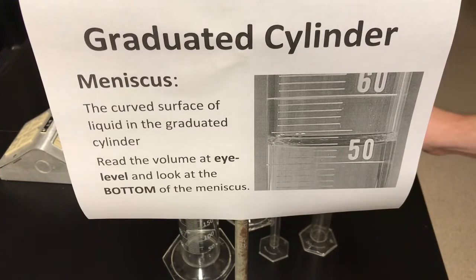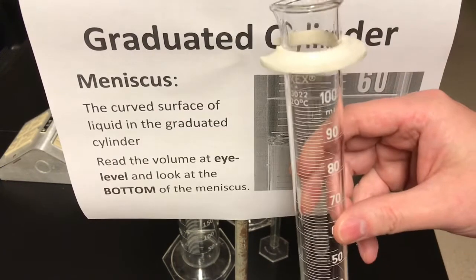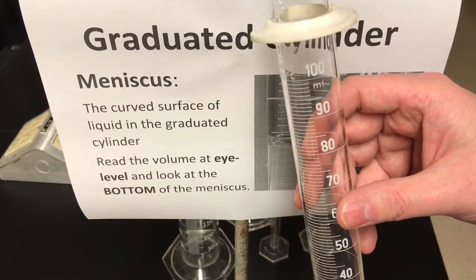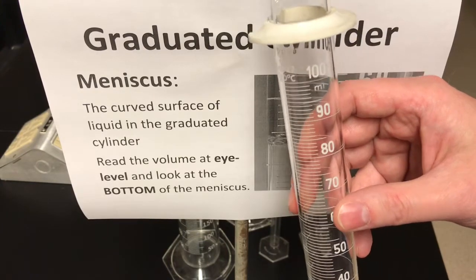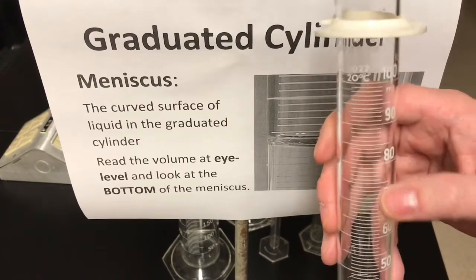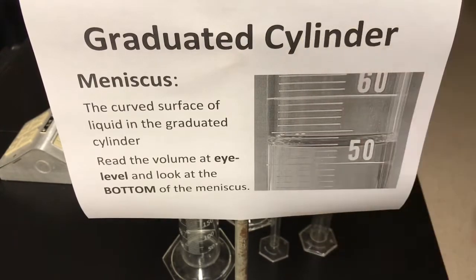When you look at a graduated cylinder again, you see the glass cylinder, but along the face of it you can see something like on the edge of the ruler. There are numbers, and then there are those little tick marks in between. So those are the graduations on the graduated cylinder.